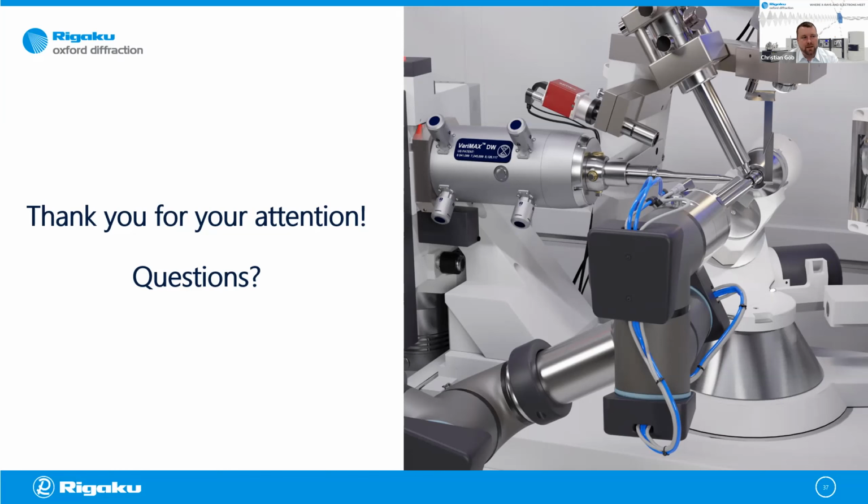So I would normally say for a completely unknown type of material, 5 to 6 crystalline sponges will be necessary. If you have an idea how your analyte molecule looks in principle, because you have NMR data, you have mass spec data, you could think of modifying that molecule, like I said, like methylation of hydroxy groups or something like this. But typically, I would say you need 5 to 6 crystalline sponges for an unknown.